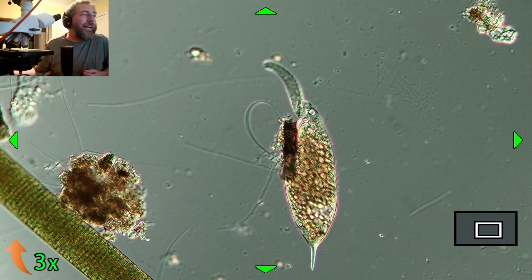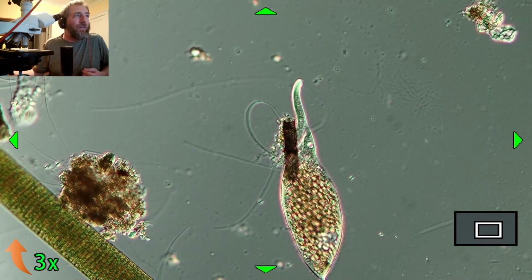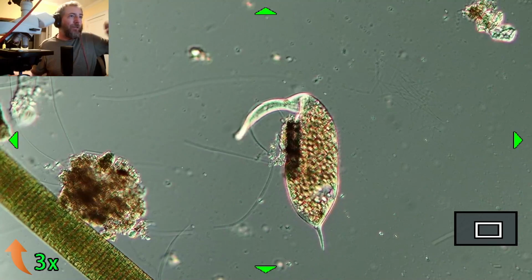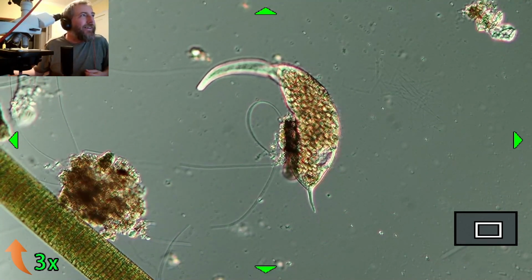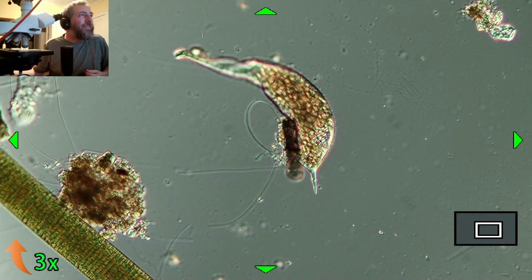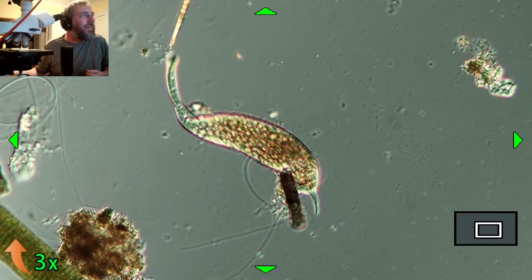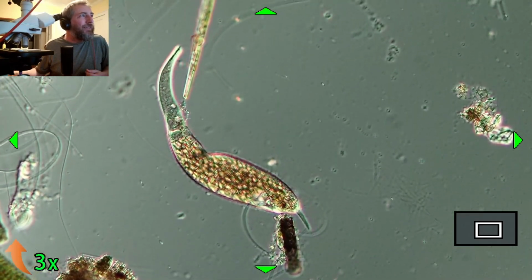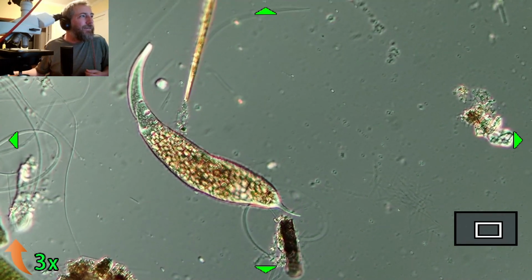And it's sort of flat, like ribbon shaped. I don't know if you can tell that until it wiggles it around, but it sort of tapers into a ribbon. You thought the neck was its tail? No, that's definitely more like an elephant trunk. It sniffs around with it. See, it's like looking where the food might be with it, in the way that an elephant might.